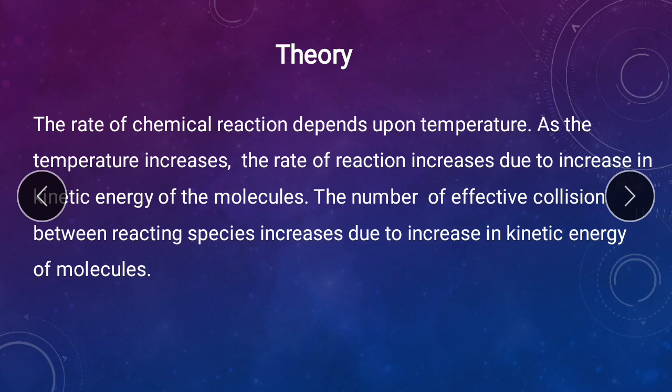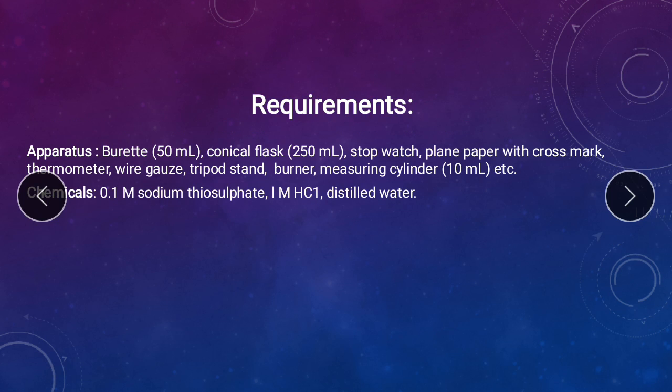Now, collision theory explains how a reaction happens. The collision theory says that as more collisions occur in the system, there will be more combinations of molecules bouncing into each other. So this is all about collision theory and rate of reaction. Let's start the experiment.